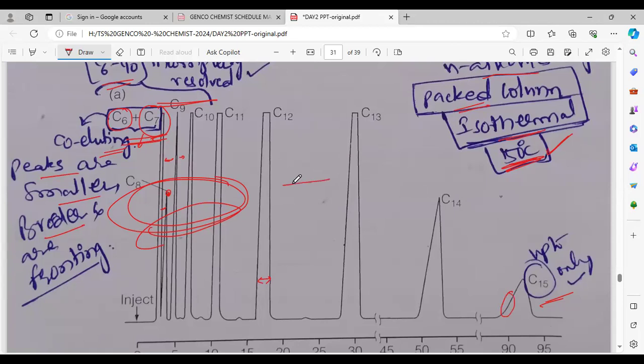సో 2 types ఆఫ్ పీక్స్ ఉంటాయి. ఇలా ఫ్రాంటింగ్ ఉంటుంది, ఇంకొకటి టైలింగ్ ఉంటుంది. ఫ్రాంటింగ్ అంటే బిగినింగ్ లో ఇట్లా పీక్ బ్రాడ్ అనేది, టైలింగ్ అంటే పీక్ హైట్ అయిపోయిన తర్వాత కిందికి వచ్చేటప్పుడు బ్రాడ్ అవుతుంది, అంటే ఇట్లా షార్ప్గా కట్ కాకుండా ఇట్లా పీక్ బ్రాడనింగ్ అవుతుంది. దీన్ని టైలింగ్ అంటారు, దీన్ని ఫ్రాంటింగ్. టైలింగ్ అండ్ ఫ్రాంటింగ్ ఆర్ 2 different things. ఓకే, టైలింగ్ అండ్ ఫ్రాంటింగ్.